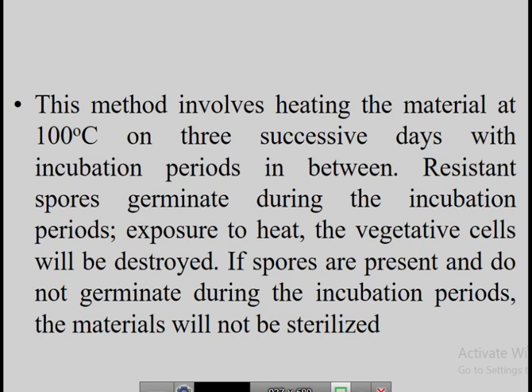After 2 days, again incubate, again expose it to 100 degrees Celsius. So for 3 successive days, the media should be exposed to 100 degrees Celsius. The significance of this incubation is that during this incubation period, the heat resistant endospores germinate, and these germinated endospores get easily destroyed when they are exposed to 100 degrees Celsius. This is the principle or significance of heating on 3 successive days at 100 degrees Celsius.